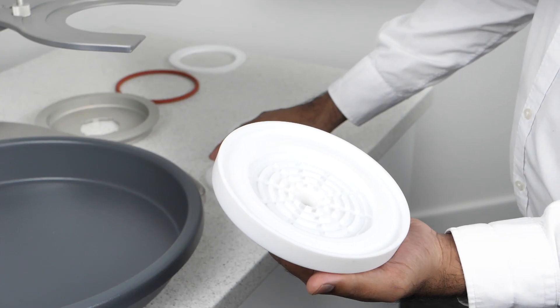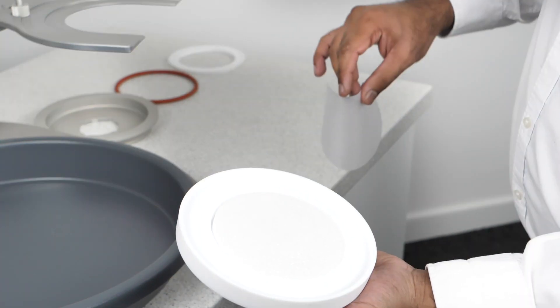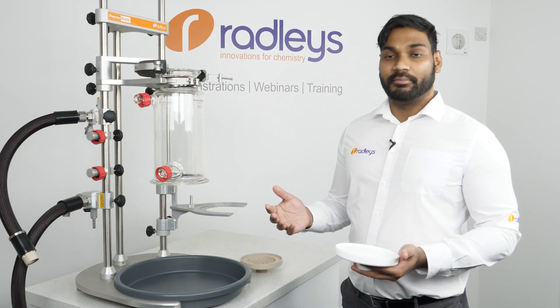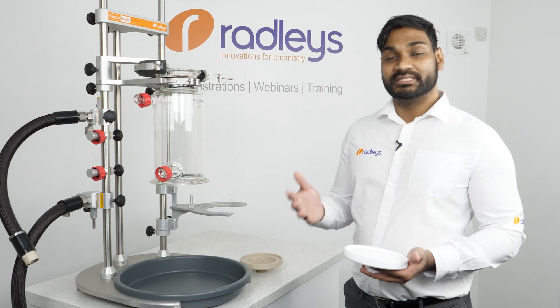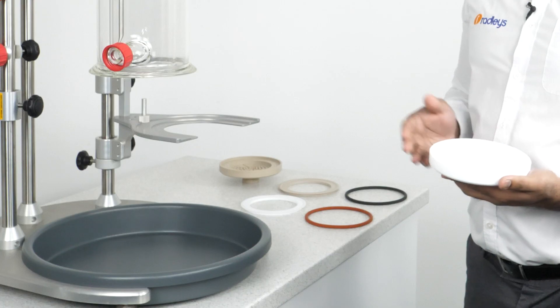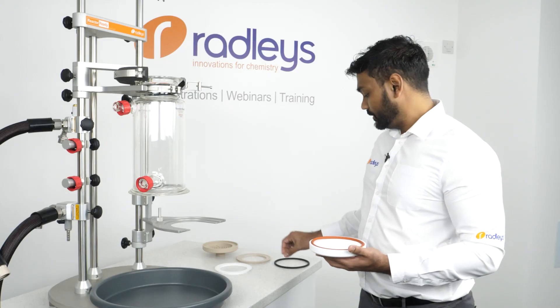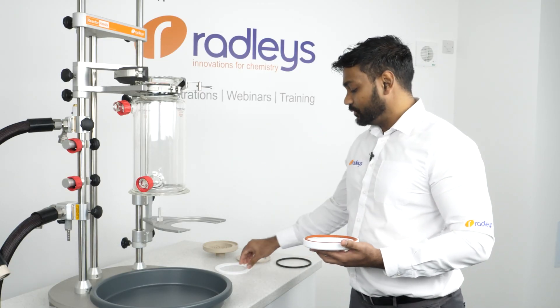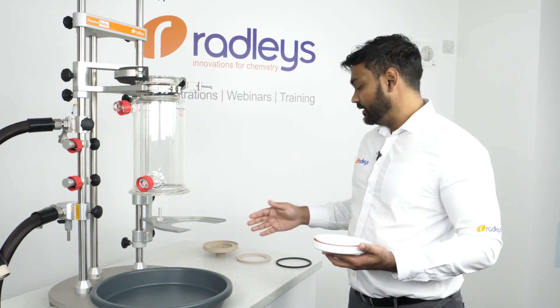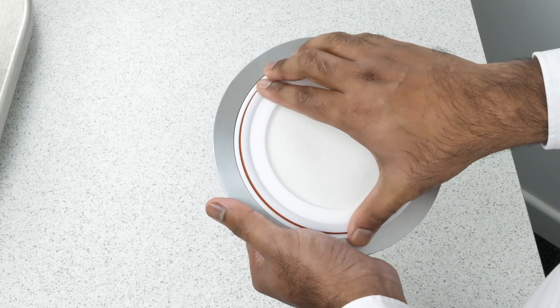We then assemble our filter base — the filter bases can be made out of PTFE or PEEK; I'm using the PTFE one here. We then place this sintered disk onto the base. The sintered disk supports the filter membrane, which we can then place on. We supply a range of filter membranes pre-cut in different materials and porosities. You can also use your own filter membranes as long as they are cut to the correct size. Next goes the filter plate o-ring, which can be made out of silicone or Viton.